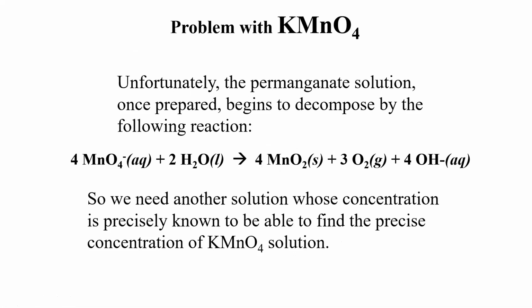KMnO4 would always decompose as soon as it is prepared. It's not a primary standard. You remember when we're talking about standards, we said that we have primary standards and secondary standards. Your primary standards are stable. When you prepare a certain molarity of your substance, you are sure that that molarity will be stable.